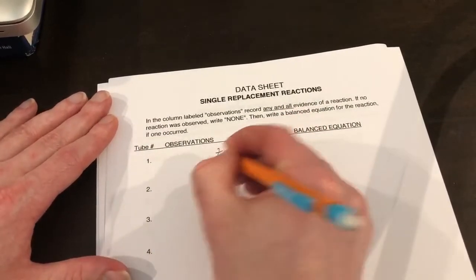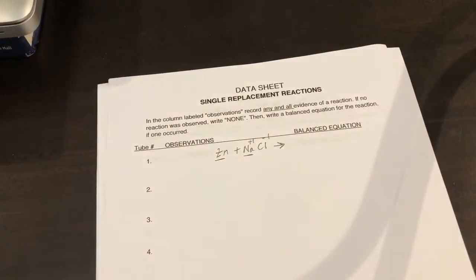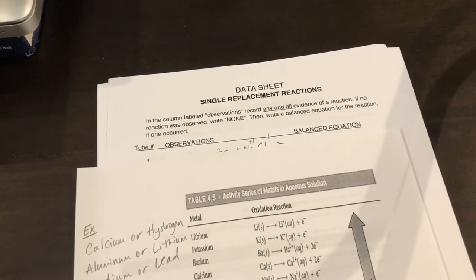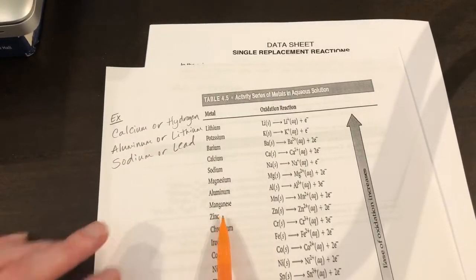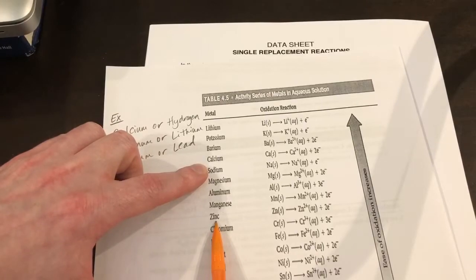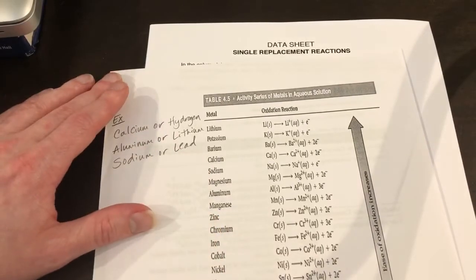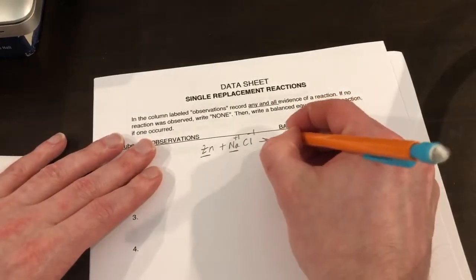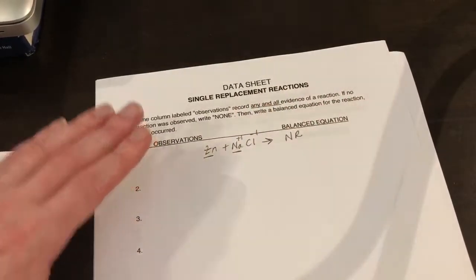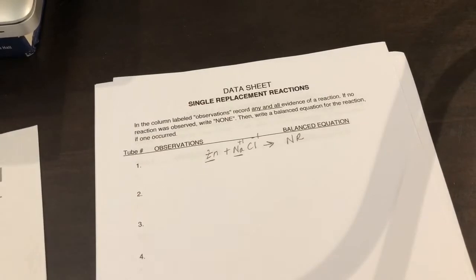Now we're going to look at our activity series. Where's my activity series paper? Okay. Our activity series says that zinc is right here and sodium is up here. Oops, sorry, zinc is right here and sodium's right here. So there's not going to be any reaction because it's got to be a more active metal to kick it out. So we just write no reaction. Okay, number 2.